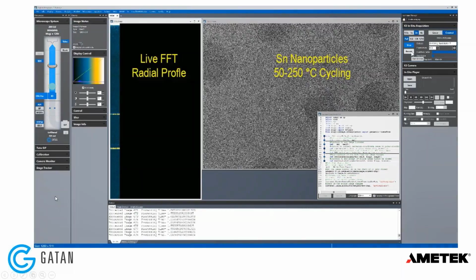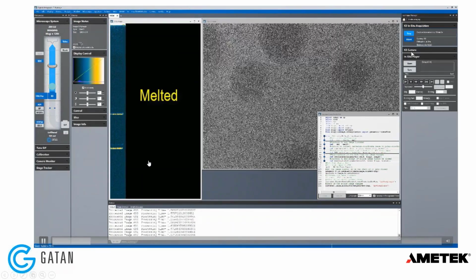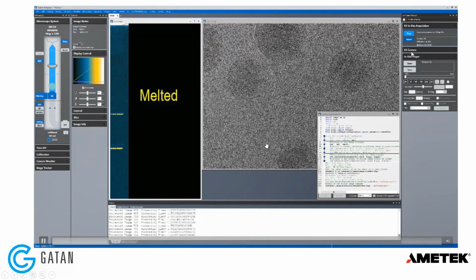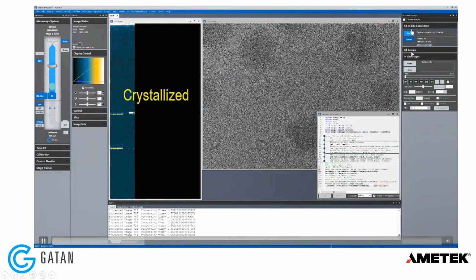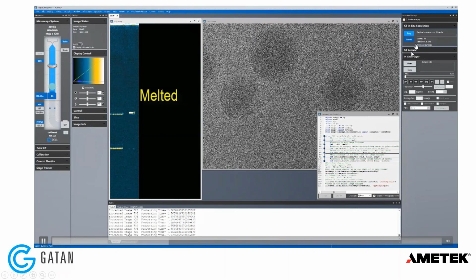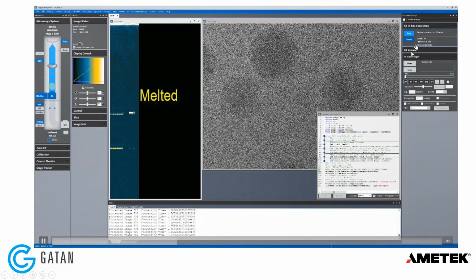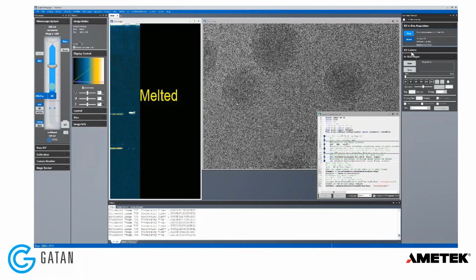Okay, so now I think this is the exact same data set during acquisition. Actually, I'm doing the Python processing live during acquisition, but I don't think I have time to really describe this fully.